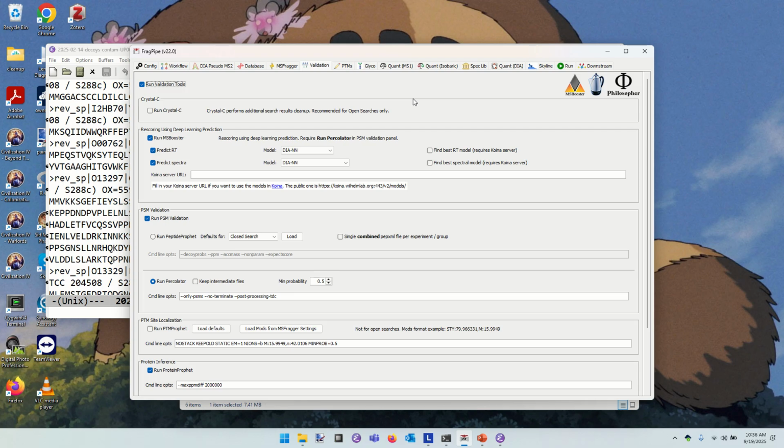So we didn't end up making any changes at all on that MSFragger page. We see that you can do lots of things there. We're not going to do them. We're going to restrain ourselves to standard mass shifts at the moment. The validation tools have a lot of impact, but in effect, most people leave these mostly alone.